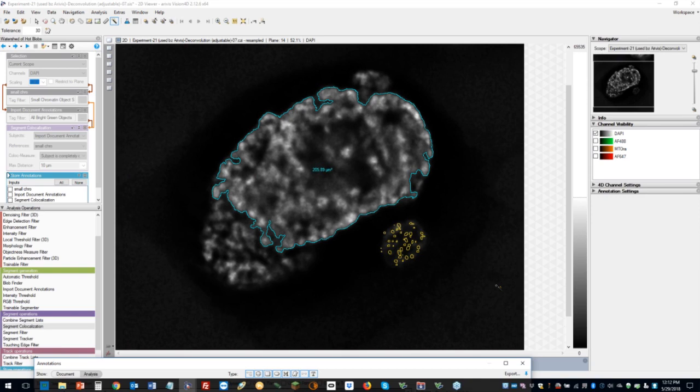I built a pipeline that could grab certain artifacts out of the image, and by counting those in the various data sets, that gives me some idea of the quality over time. So maybe it would be something similar. It would be some kind of a pipeline that would extract a specific feature in your imagery, and then we would compute for you certain features that are important for quality control. Right. Okay.